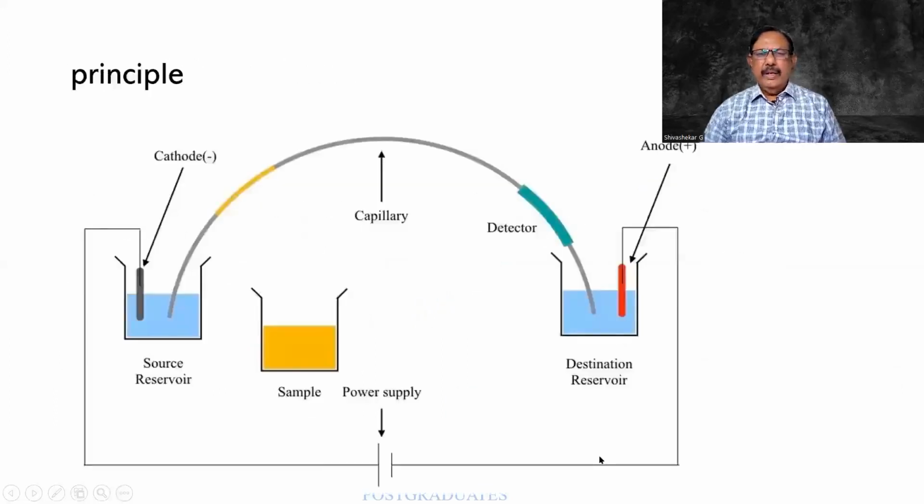A basic principle in the case of a capillary. So this is a capillary, a sample is admixed over here and it is traveling. A detector is used to find out where exactly it is. It is very rapid and can be performed for small tests.